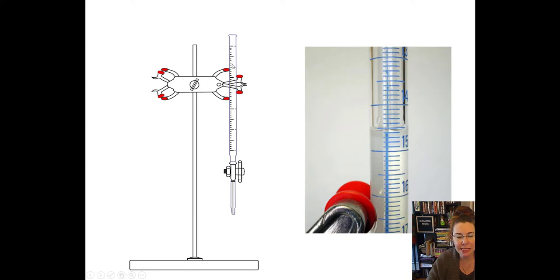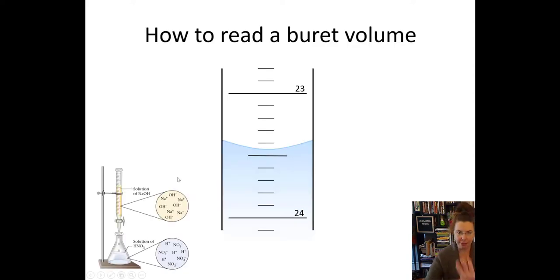you're filling it up and then releasing solution from that burette. And as you release the solution, you're using it. So if you read the numbers properly on a burette, it shows you how much you have used, not how much is still in it. We'll talk about that a little bit more. So here, this, if you were looking at it traditionally in terms of like a graduated cylinder, you might say that this is 14.55 milliliters. And that's because we read it from the top down. Here's our 14. Here's our 15. We read it from the top down. So let's practice reading a burette really quick.